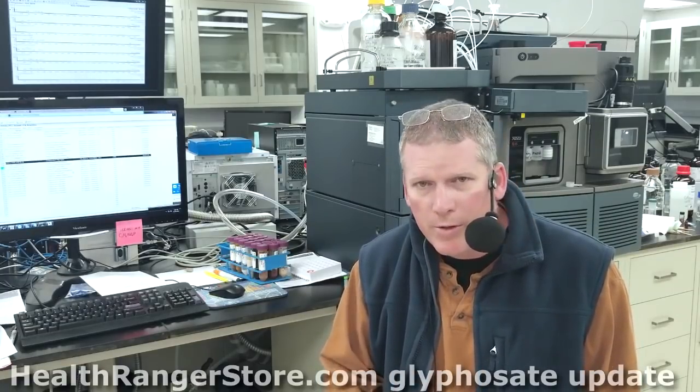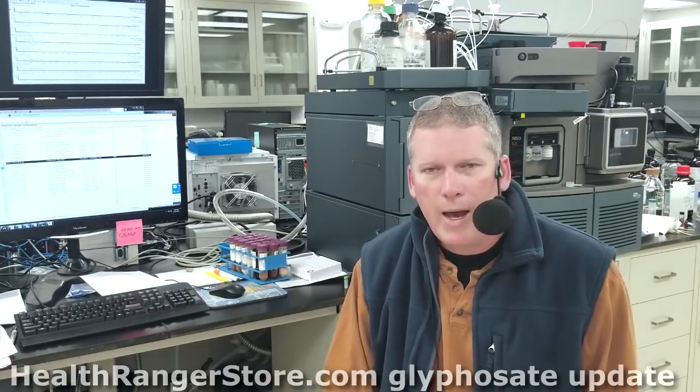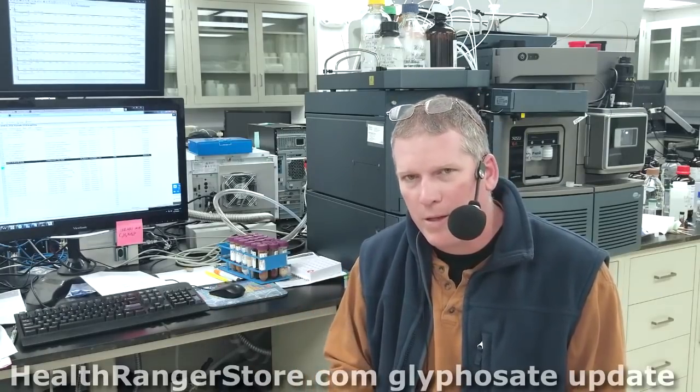Again, for almost 2 years we've gone through many, many different columns. We've tried different methods. We've tried different instruments. We've tried different chemistry, different levels of acids, different levels of buffers, different pH, different column temperatures, different retention times, different guard columns. We've gone through many, many iterations, like things that I can't even get into. The different things that we have tried here to perfect this method.